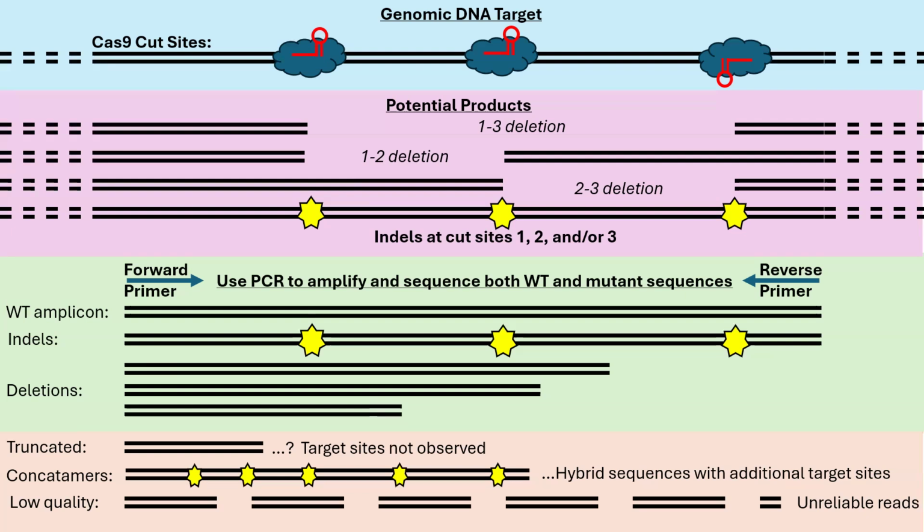You can do this in real time in your own lab if you have one of these sequencers as well. And the price is right at about $30 per sample. So we're accepting a little bit of error here to get the data back faster so that we can utilize these cells earlier on after they've been modified.